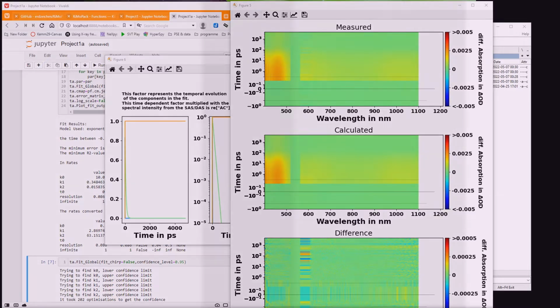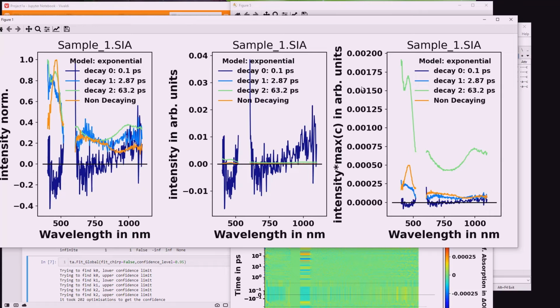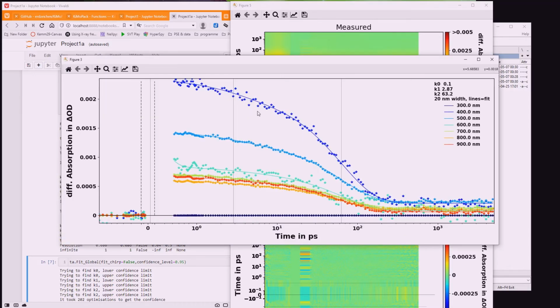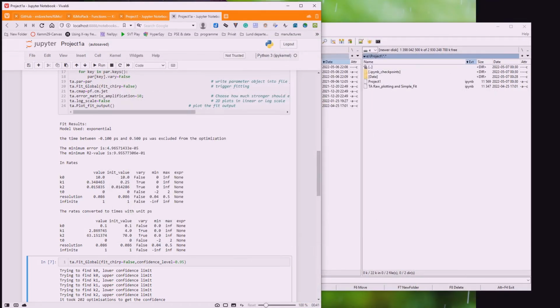Typically, when I start by looking at the decay associated spectrum, there is no mirroring, there is no compensation. The times are in the reasonable range. They're only slightly changed from where I started. The kinetics are of course perfect, or closer to it. I don't see really any strong differences in itself. There are no features in the 2D matrix. These times are more informative.